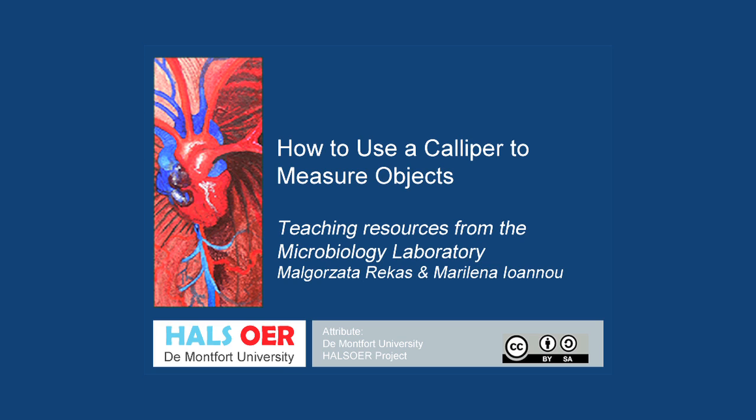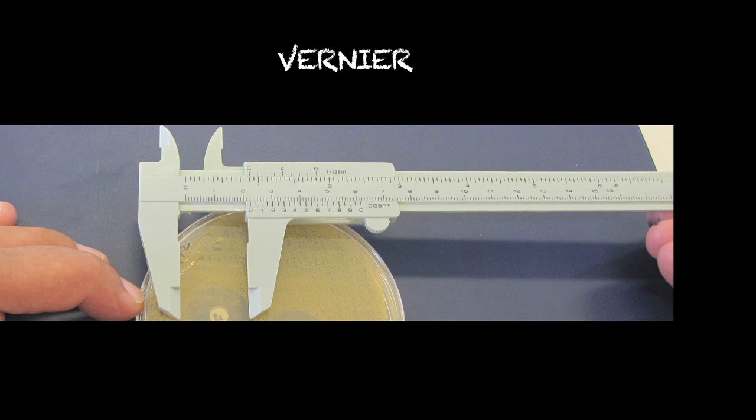How to use a caliper to measure objects. This is a vernier caliper.